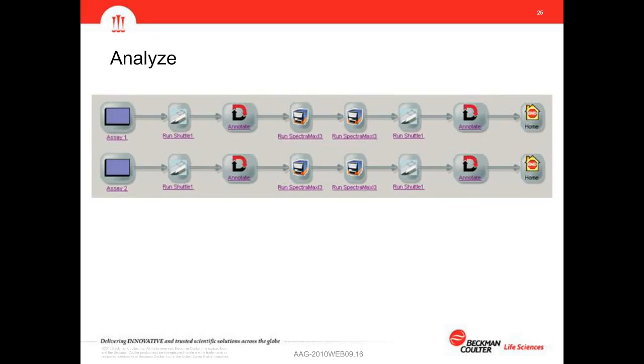So here's a simple Sammy method. It's just linear. It's take the plate out, get it to the reader, and then store it back away. In this case, we have 2 plates being run through simultaneously. That was just a decision on how to most efficiently use the system.